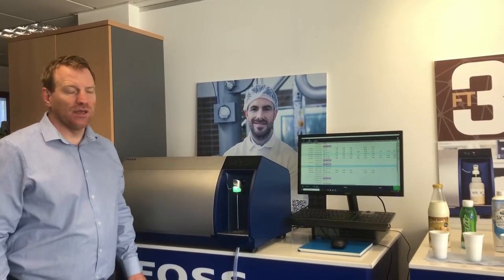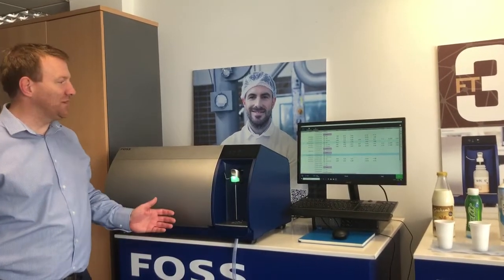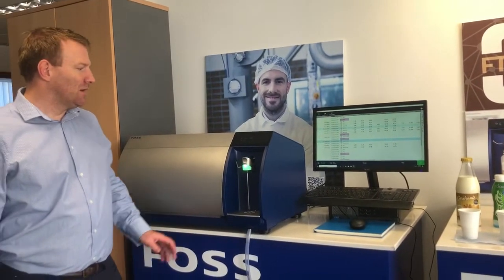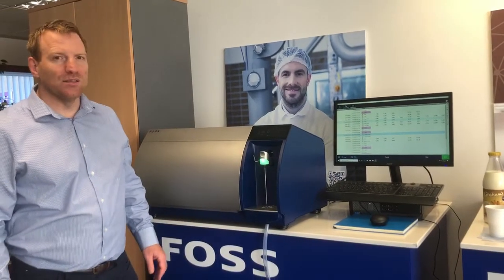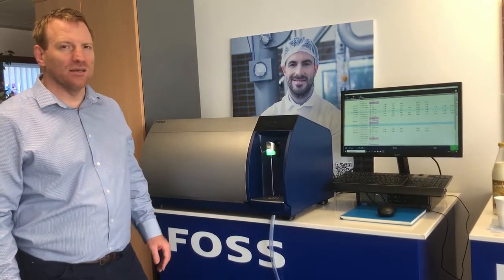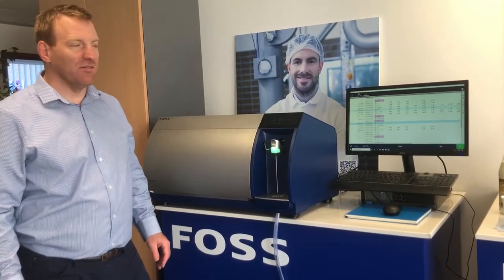Hi, Russell from FOSS here to talk today about our brand new technology, the MilkaScan FT3. The MilkaScan FT3 now has a brand new intelligent flow system that allows us to use one analyser for a wide range of dairy products.